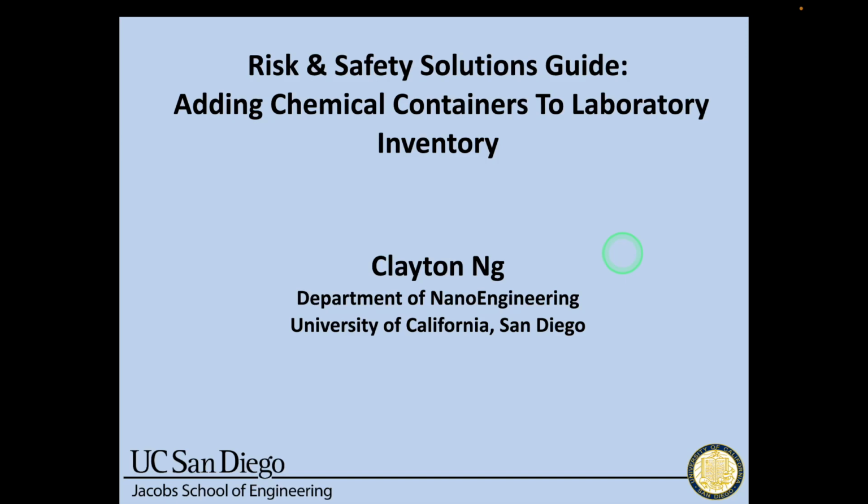In this RSS tutorial, I'll be showing you how to add chemical containers to your laboratory's chemical inventory profile.